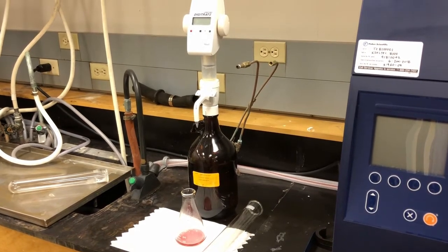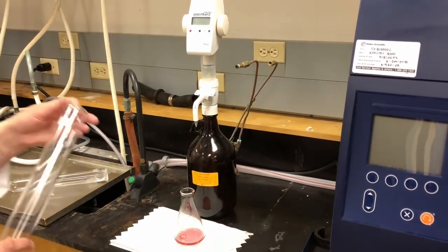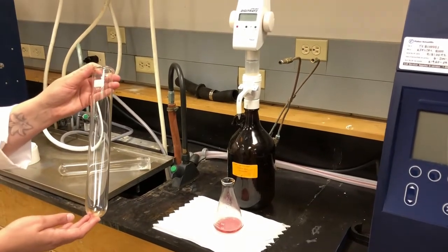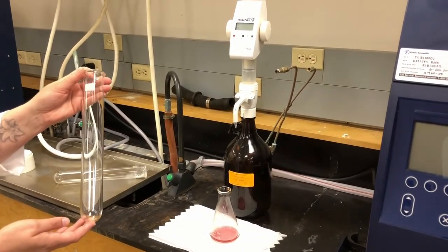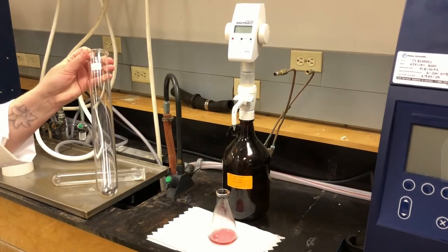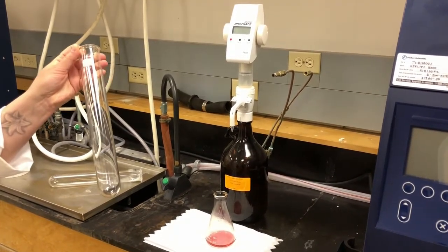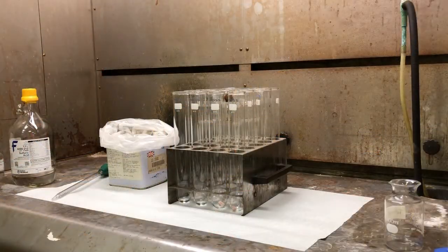So we're going to start with our samples. This is the digestion tube that we use to put our sample in, that we add the sulfuric acid and the catalyst to. It's basically just a large test tube. So we're going to start by measuring out our sample into the tube. So now we're ready to get our samples ready to digest.